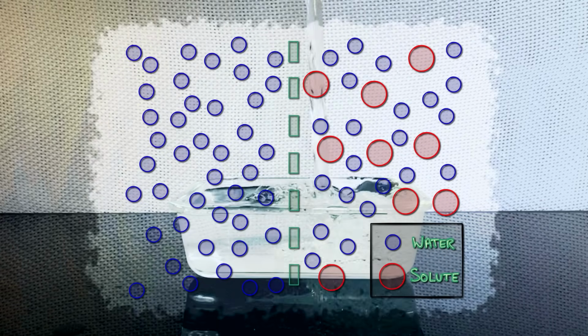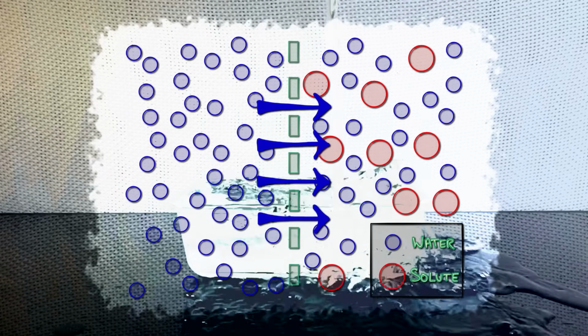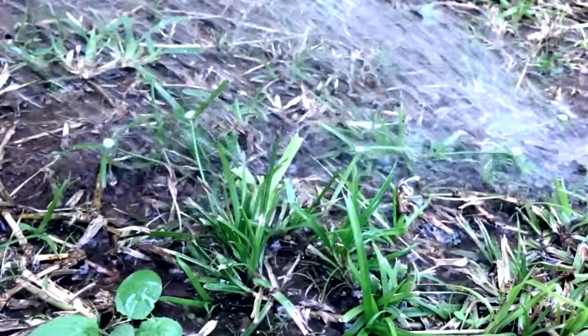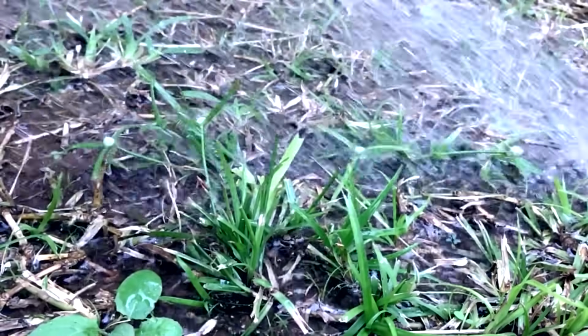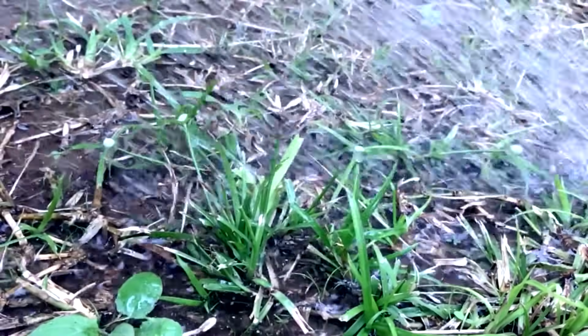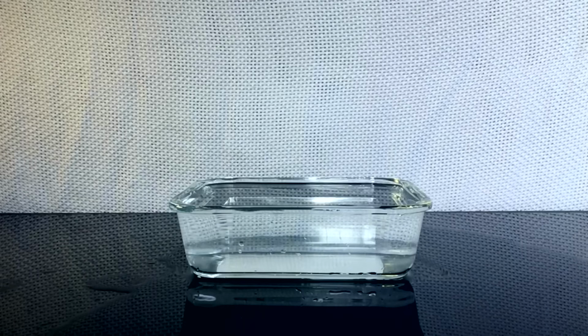If there is a partially permeable membrane, like a cell membrane, separating two different water samples, there will be a net movement of water from the place with a higher water potential to the place with a lower water potential. This is the reason plant roots take in water. The rainwater that enters the soil has a higher water potential than inside of the roots, so water moves into the roots by osmosis. Well, we can demonstrate this in a lab setting using potatoes.